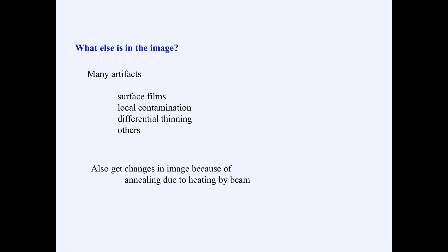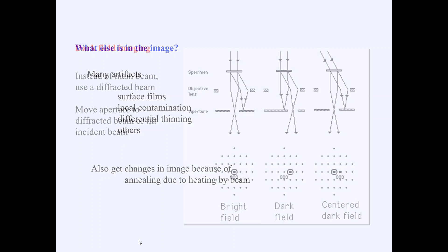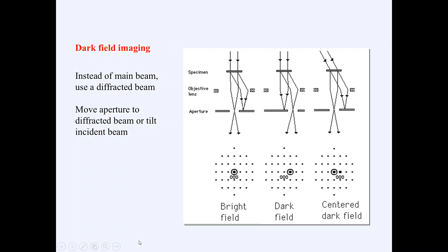There are also many other artifacts in TEM images, such as surface films, local contaminations, and differential thinning. Along with that, we can also get changes in the image due to annealing caused by heating from the electron beam. When we have diffraction from the electron beam, heat can be generated, causing some degree of annealing due to heating by the beam.